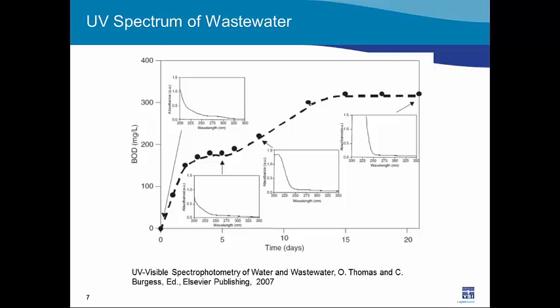Taking a look at an example, this should look familiar to people out there. This is a BOD curve, so this is the BOD over time.